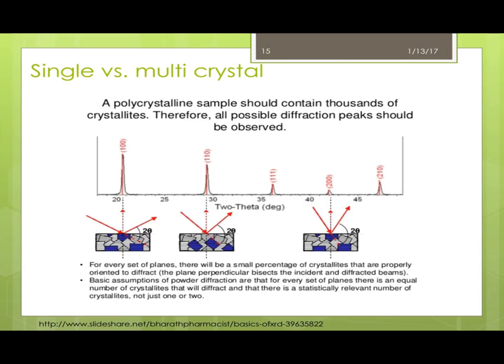On the other hand, if there are multiple crystals present, let's say in a powder form, then this problem can be circumvented. This is because the packed powder forms all the crystallites with different plane arrangements that are randomly oriented. Therefore, there will be a number of crystallites that are properly aligned to diffract in all orientations at some point in the powder.